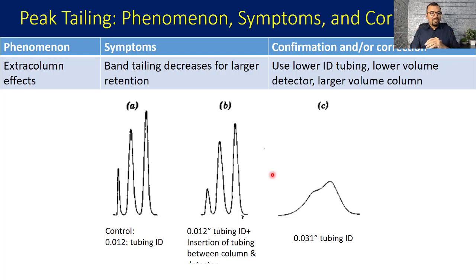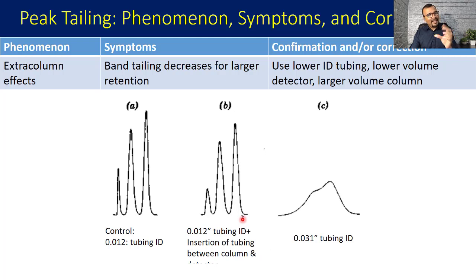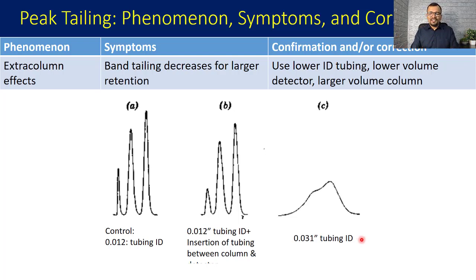These are representative examples of what can happen because of the inner diameter of the peak tubing. Chromatogram A is a control with tubing of 0.012 inch. Chromatogram B is again with 0.012 inch but with an insertion of tubing between column and detector, resulting in a slight increase in extra column volume and slight increase in peak tailing or broadening. Chromatogram C uses an inner diameter of 0.031 inch, and you can see how the peak shape gets disturbed.